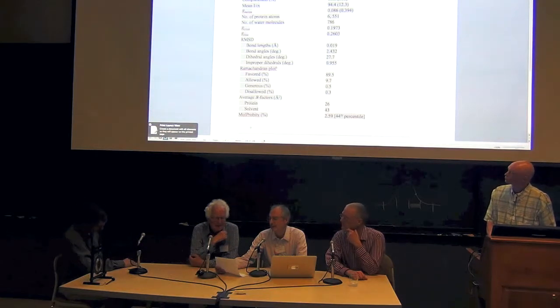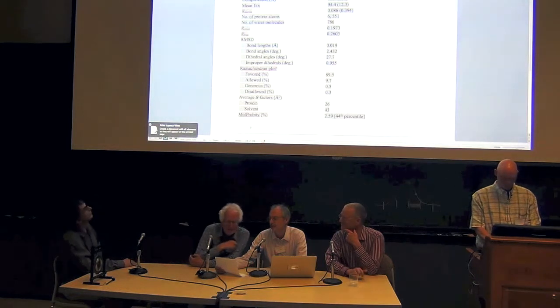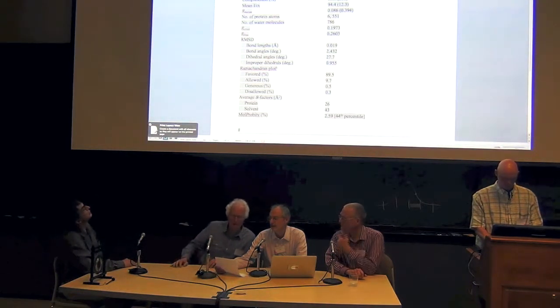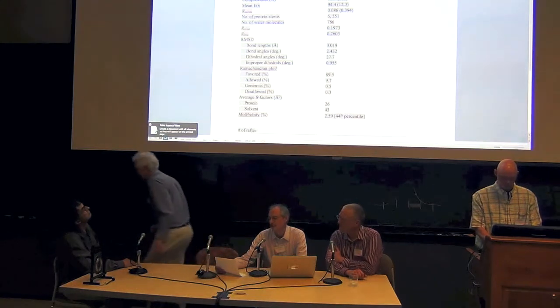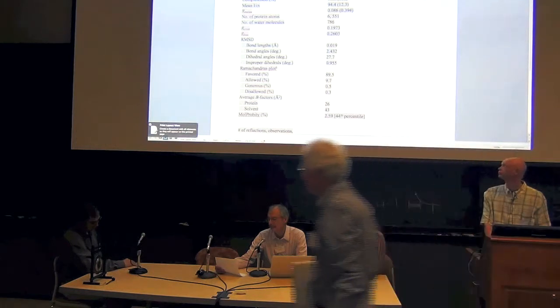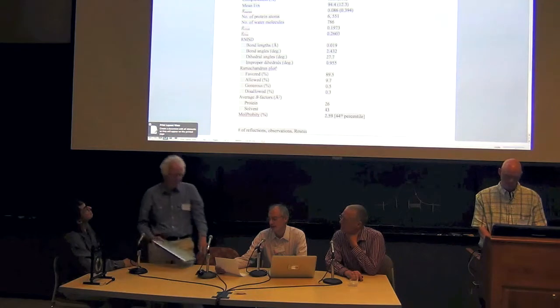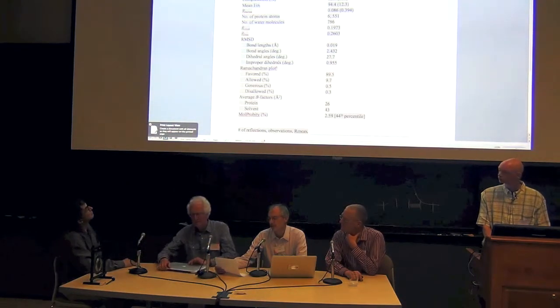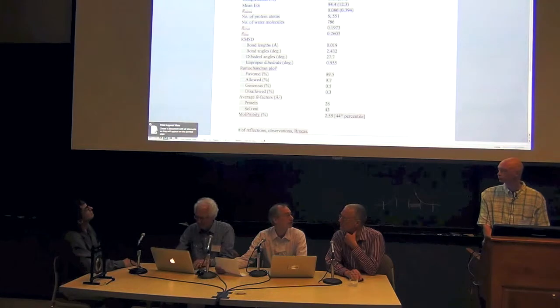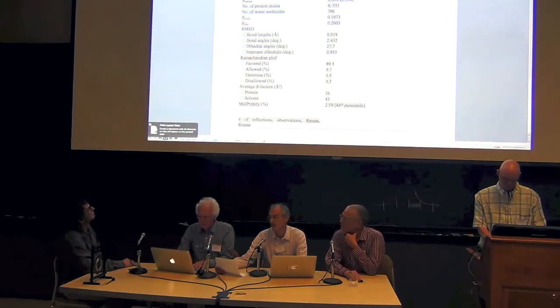And it doesn't show the total number of reflections, does it? Observations. Reflections. So you would have to calculate that. So I would probably show the total number of observations myself. And so it would be 22.5 times 98,000, right? It doesn't show an R measured as already, and I would show that. If you were using anomalous data to solve the structure, I would show an R measured anom, for example. It's hard to know what's going on there.